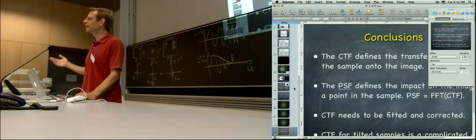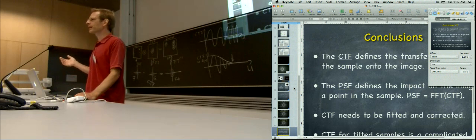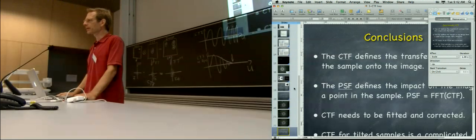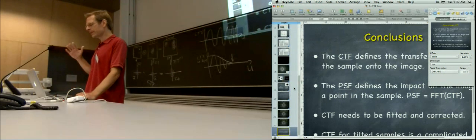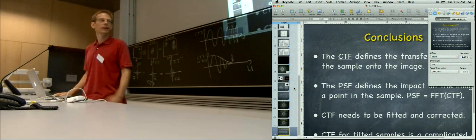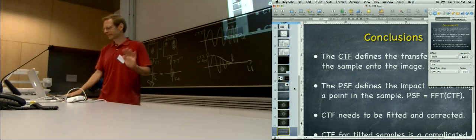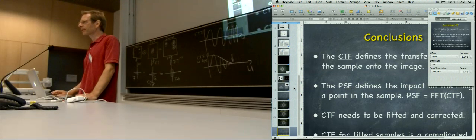Is it right what I'm saying? Yeah, so it will come soon. And I think people like Hong Zhu and Holger Stark are all implementing that now into their single particle solutions. But so far, Richard Henderson is 40 years ahead of the rest of the field. By having understood that beam tilt puts complex valued contrast transfer functions into practice, and he even implemented in Auto Tilt how to deconvolute that. So I have the biggest admiration for his creation in the MRC software.